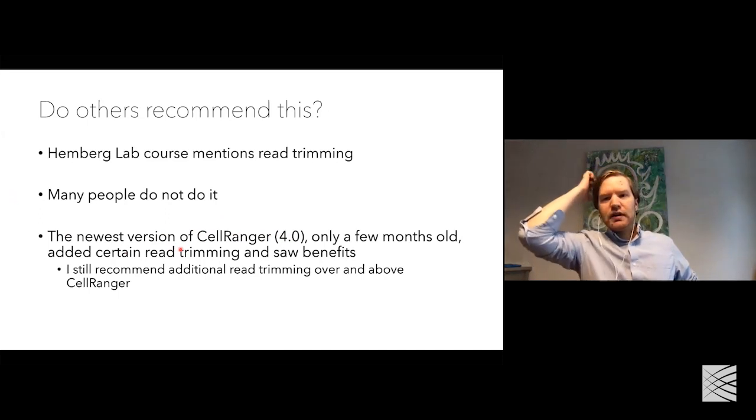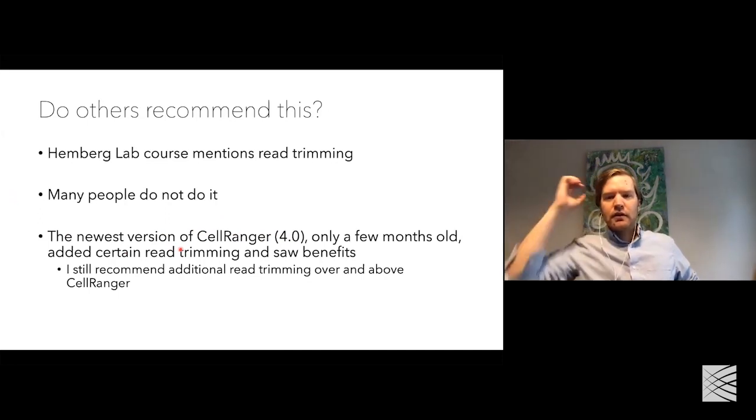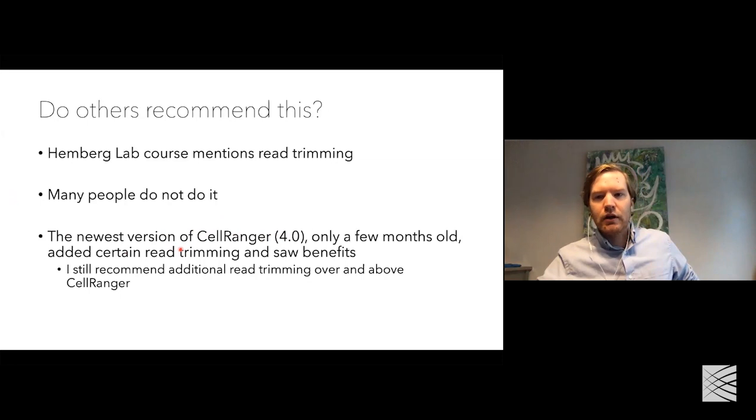So it seems like 10x Genomics has caught on to this as well. And it really does seem like a valid procedure. I would recommend it. And the read trimming I've recommended goes a little bit above and beyond what Cell Ranger does in 4.0. And I think the extra bit that I do is justified.